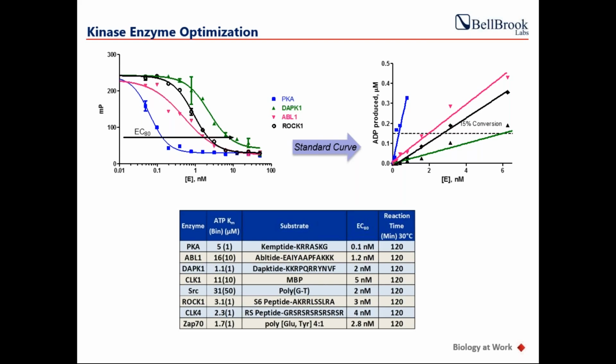in order to avoid depletion of your inhibitor with your enzyme, you have to be using an amount of enzyme that's down in the same, hopefully lower than your inhibitor concentration, certainly not significantly higher than it. Otherwise, you're actually titrating out your inhibitor with your enzyme.